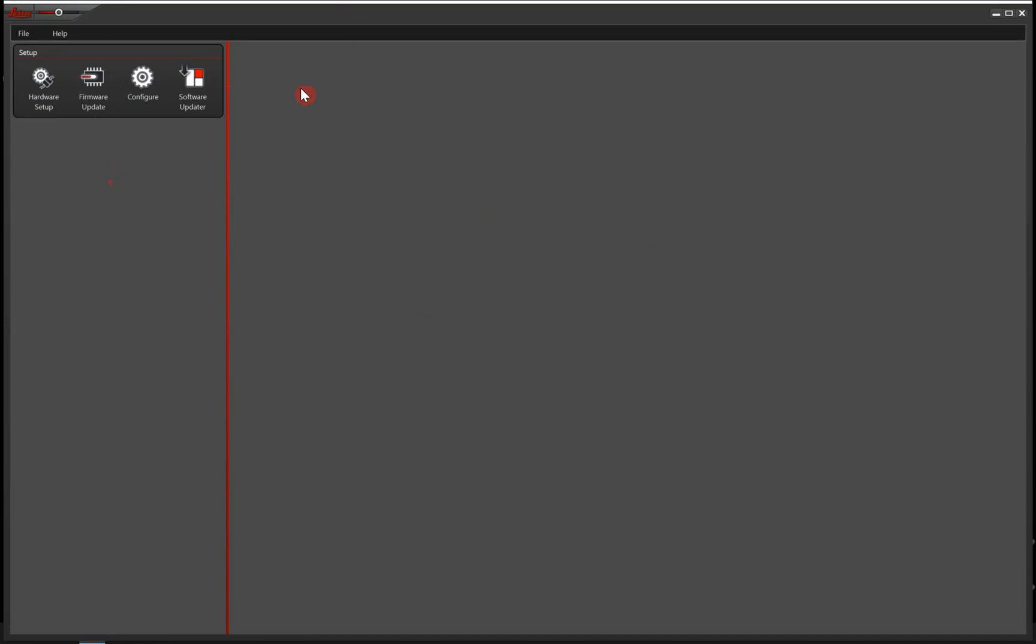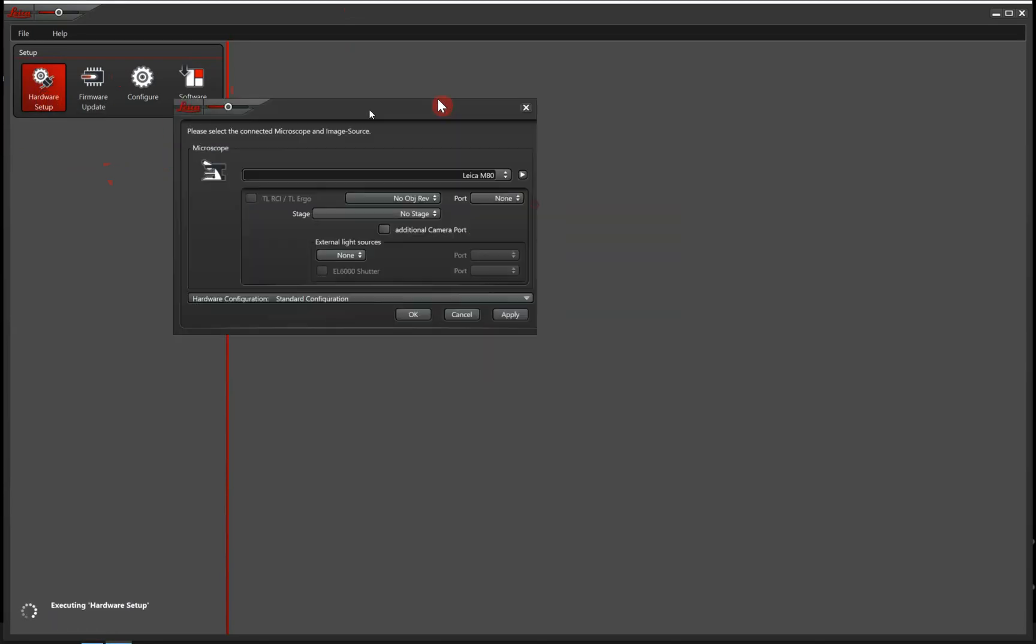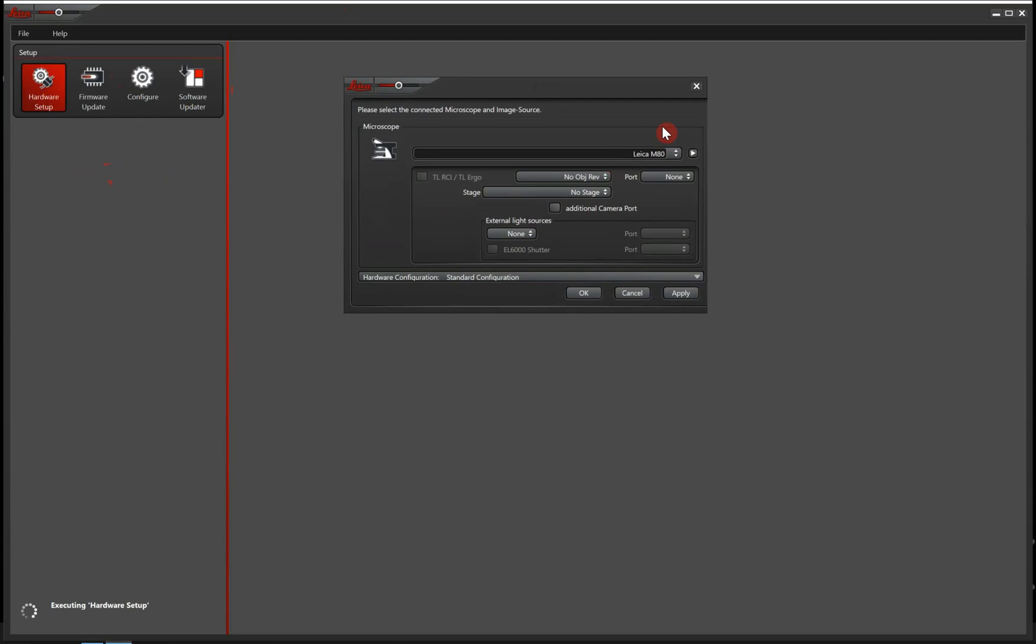So we are in the hardware configurator, and the first thing we are going to do is enter the hardware setup.